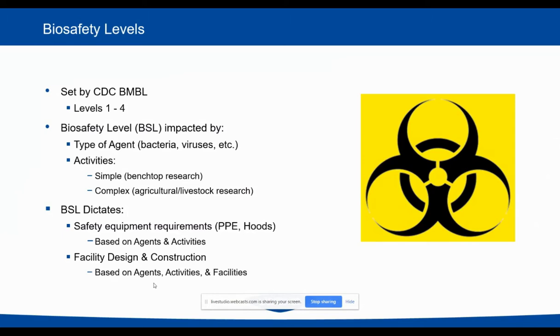And just to go into that a little bit more clearly, there are 4 key classification levels for biosafety: BSL 1, 2, 3, and 4. As you look at them, the lowest means the least pathogenic or the least risky, up to BSL 4, which would be highly pathogenic, non-curable diseases such as Ebola, for instance. So you'll see those terms used throughout. But by and large, the BSL level dictates what kinds of equipment and safety precautions you need to take.